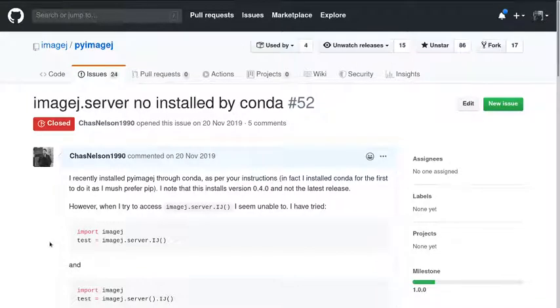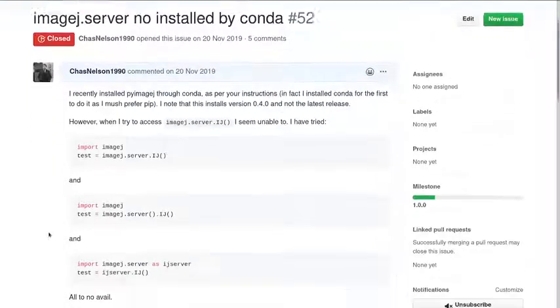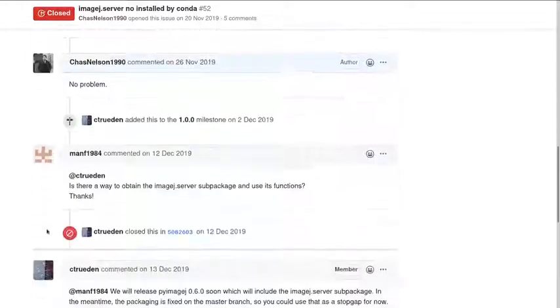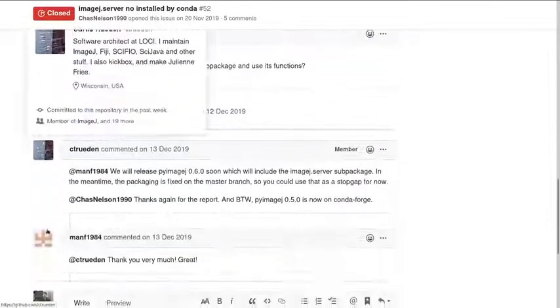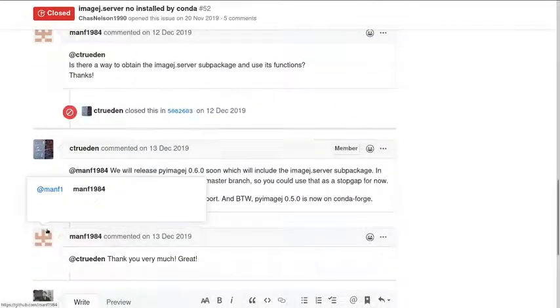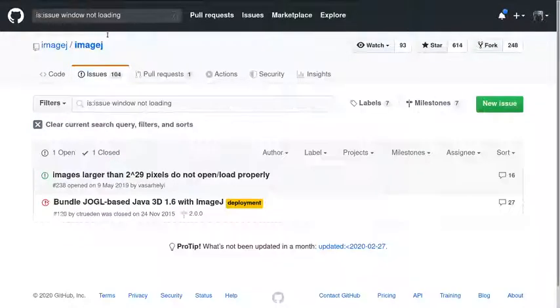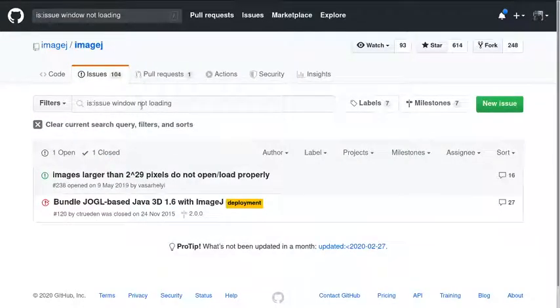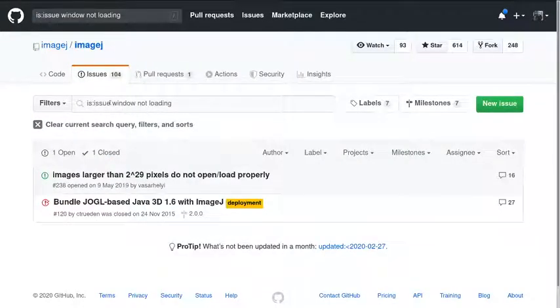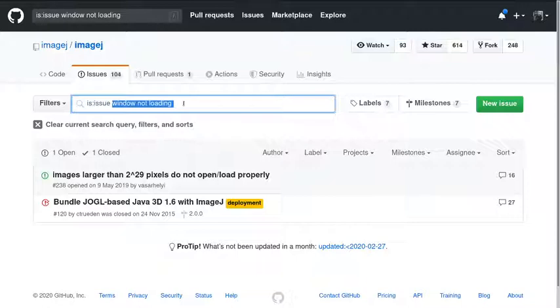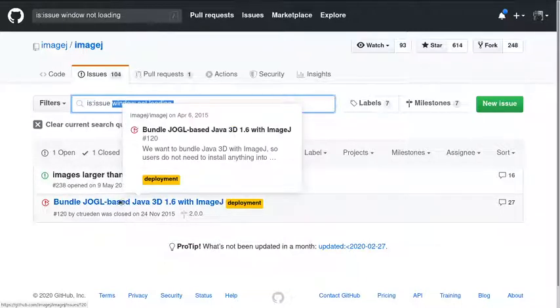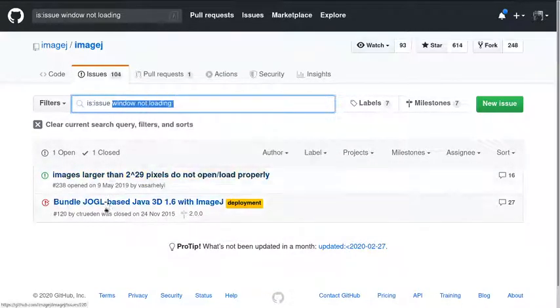I think as well, it's a really useful place to find solutions to problems. So let's take, does anyone have a problem that they've recently had in ImageJ that they want to see if we can find a live solution to? This is dangerous because it could go very wrong. No? Let's go with, let's just say we've got something, it's a plugin and the window is not loaded. If you go onto the GitHub for ImageJ and the issues and search 'windows not loaded,' you will find excellent, a couple of examples where people have had problems with windows not loading.